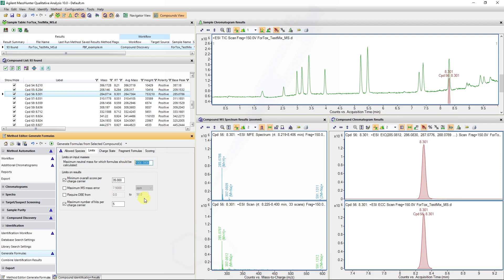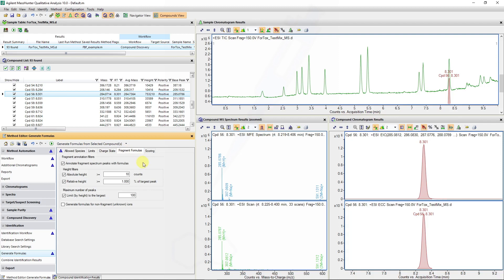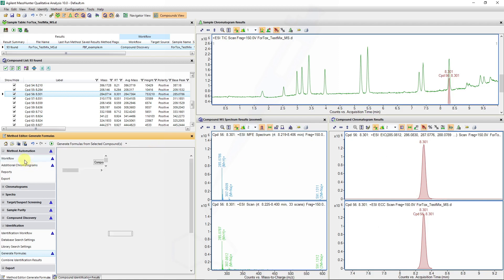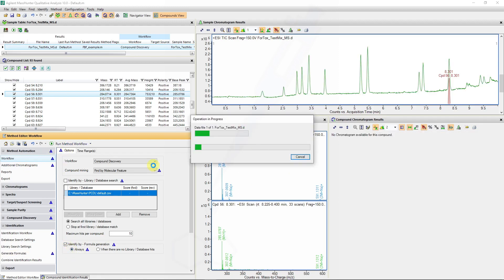For the limits, we can also set these for different data types. The maximum neutral mass can be increased for large molecule type molecular feature extractions. For now, I am not going to annotate any fragment spectrum — we don't have any fragment information from this data file. In my workflow, I will identify by formula generation and rerun that method workflow.